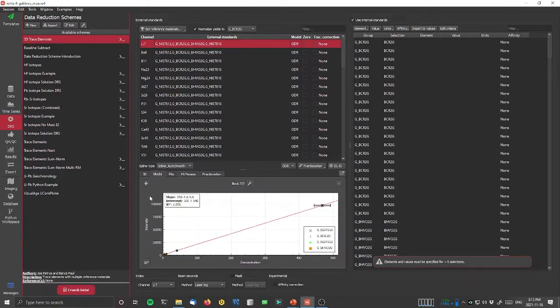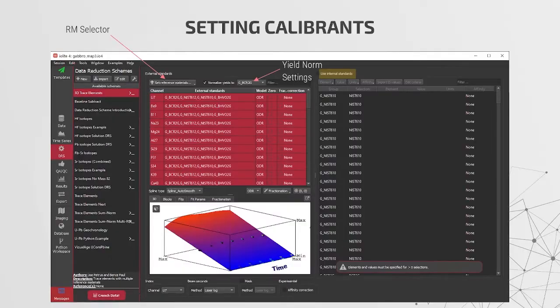So now if we go back to our blocks tab and just have a look at, say, the first block, how did we get this calibration curve? So this red line is our calibration curve. How did it calculate that? Well, we can choose which fit model we want here. And we can choose between these options. What these letters mean is shown here.